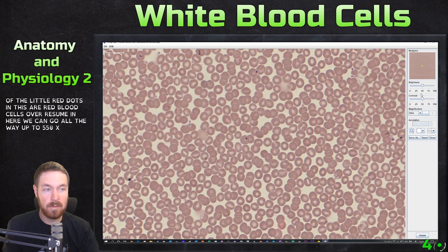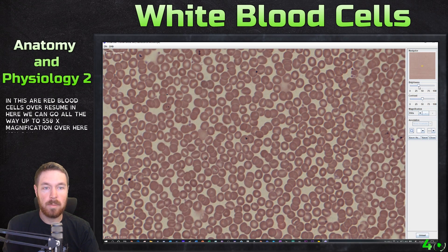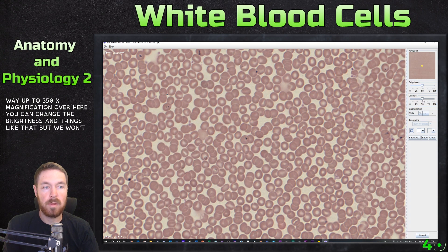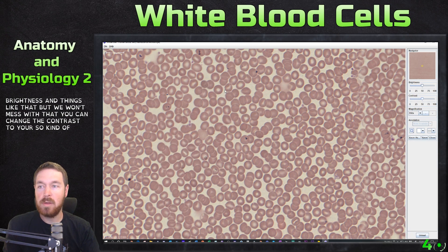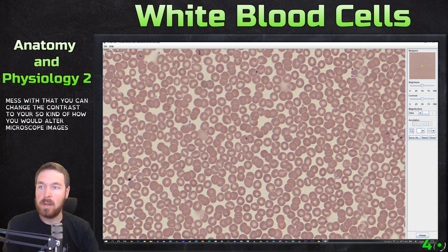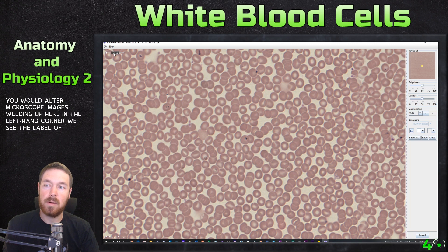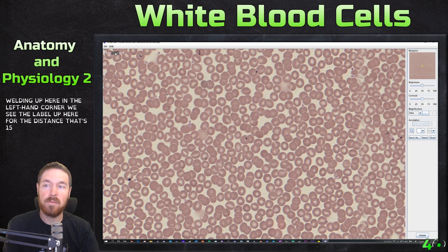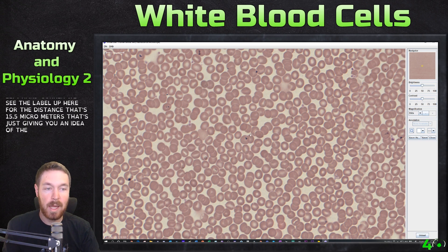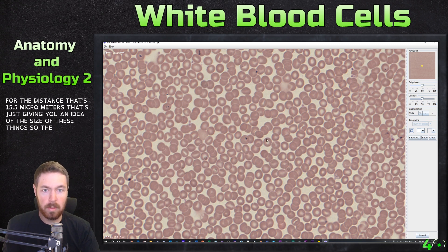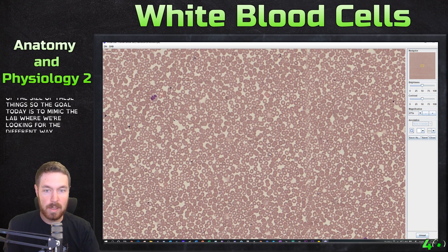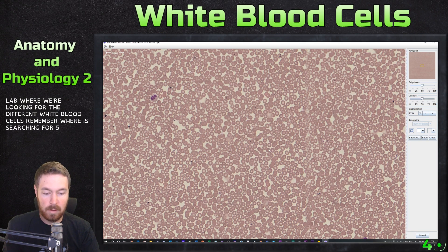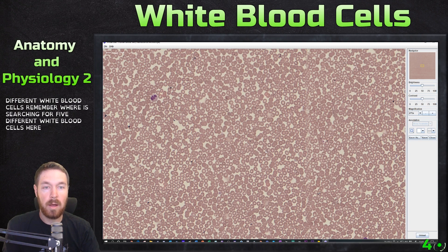You can change the brightness and contrast, similar to how you would alter a microscope image. Up in the left-hand corner, we see a label for distance — that's 15.5 micrometers — giving you an idea of the size of these cells. The goal today is to mimic the lab where we're looking for the different white blood cells, searching for five different types.